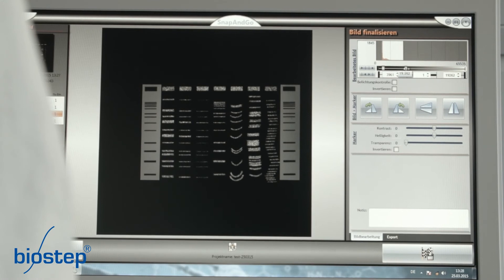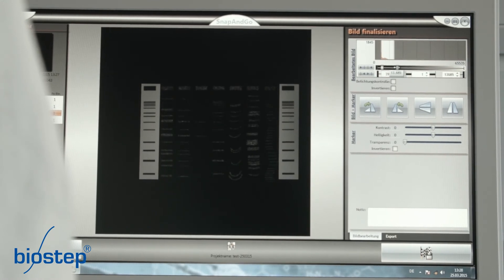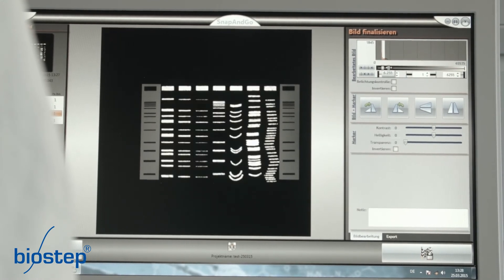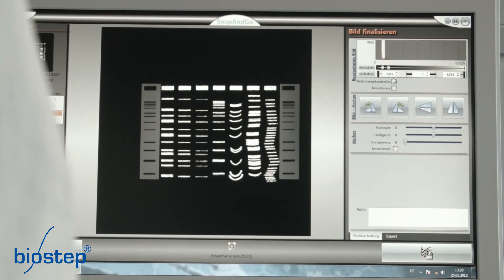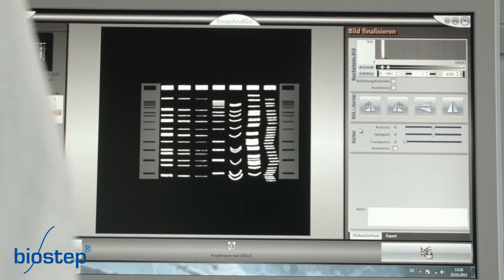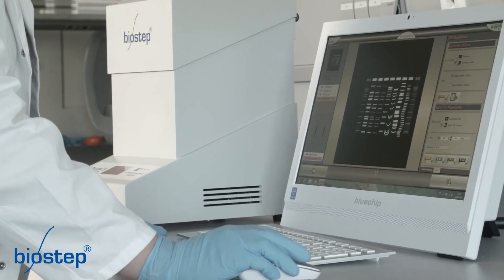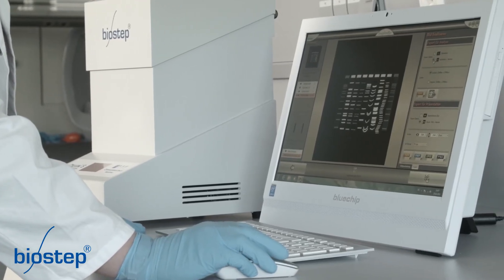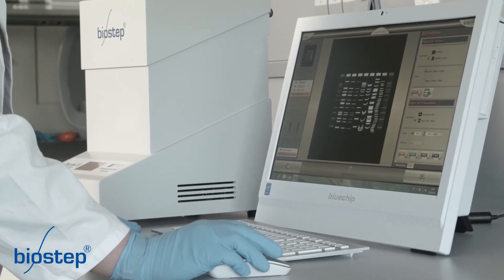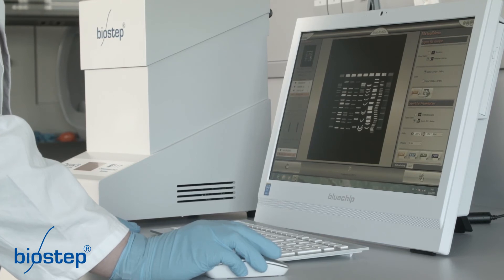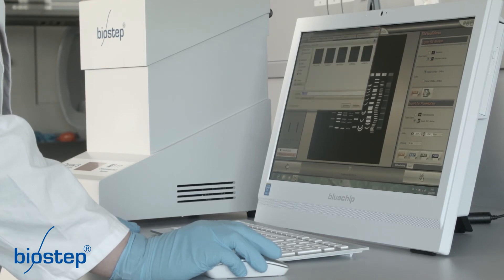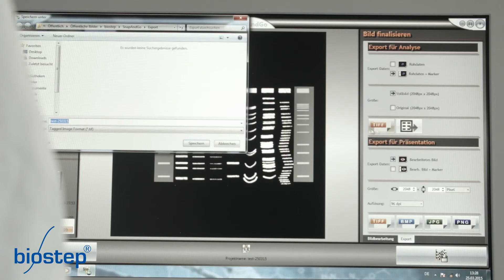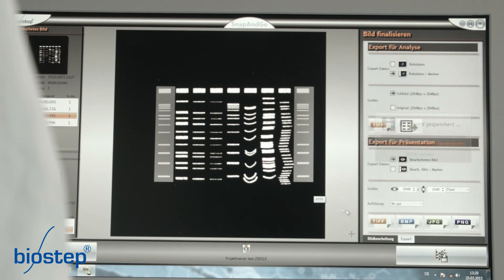Select the desired export options — for example, raw data image with markers for analytical purposes or an optimized image for presentations. Save the images. Save the project by clicking on Save and Finish.